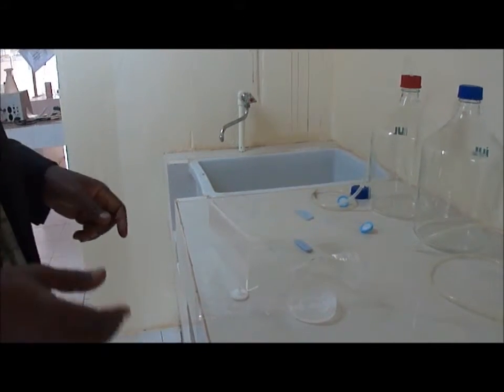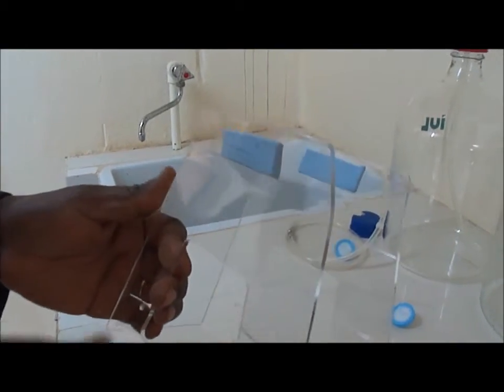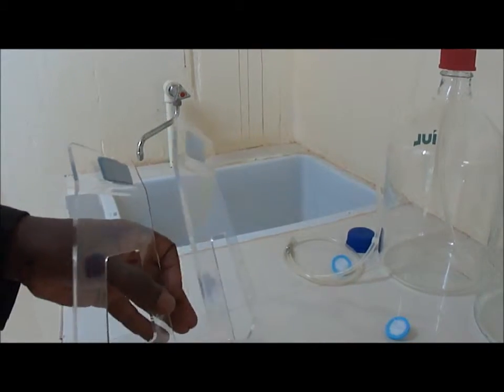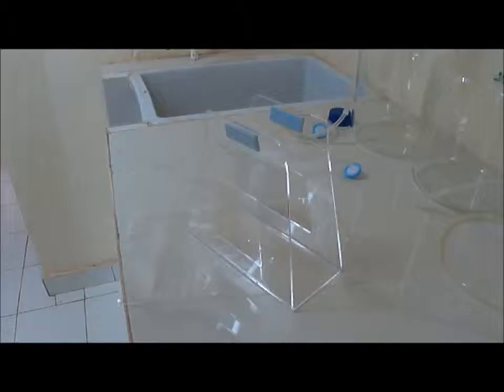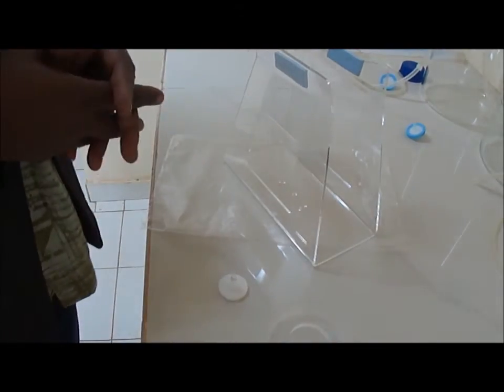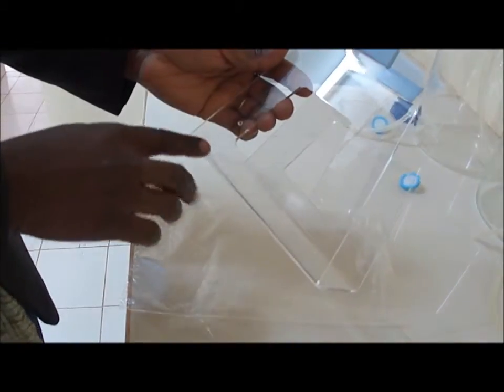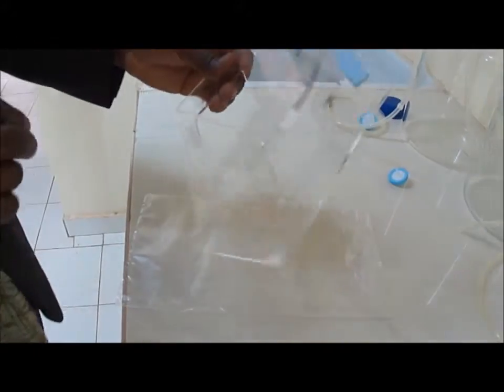The third set of elements is this one. Actually, this plastic, more or less trapezoidal support, which will receive this plastic bag. The third set of elements, which comes with the whole system of smart dilution for multiple dilution, is this plastic support with a more or less trapezoidal shape, as you see here.